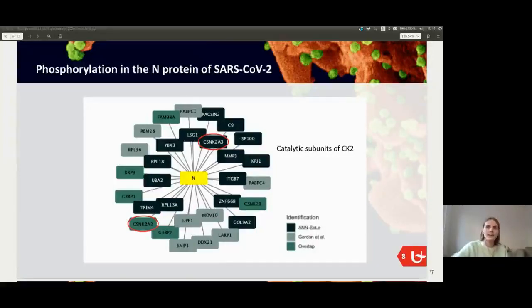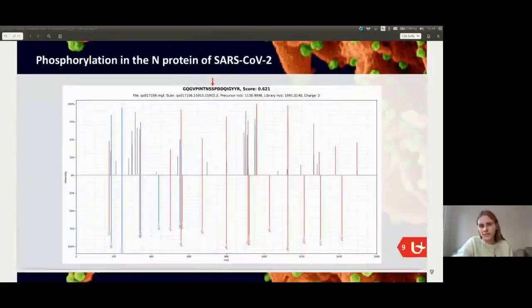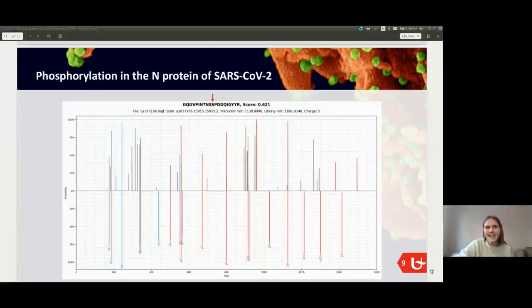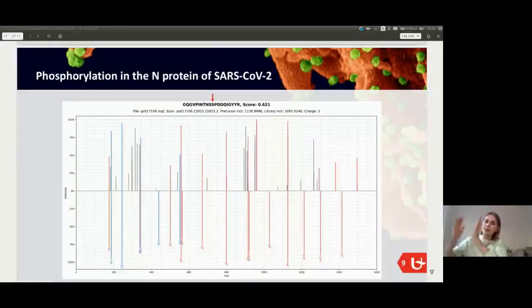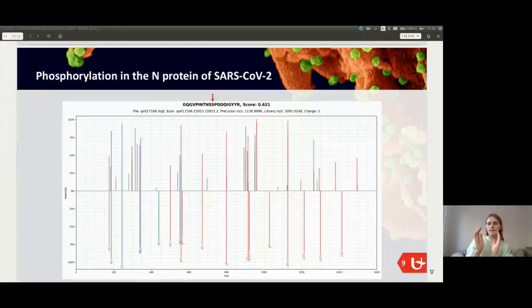CK2A3 is a kinase. And we thought it would be interesting to see whether there are spectra that were matched to the N protein that contained phosphorylation. And we found a couple of spectra that did. So we used a tool to look at the spectra and see whether we can pinpoint the modification. Here you can see visualization of the spectrum. And you can see that at the end, the spectra has shifted. And this is where the phosphorylation occurred. So the mass is larger because at that part of the peptide, the phosphorylation is present. And it could be located to one specific serine. And this same serine was predicted to be a phosphorylation site of CK2, the kinase that was also found to interact with the protein.